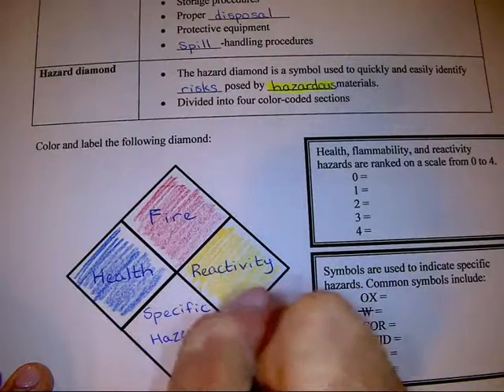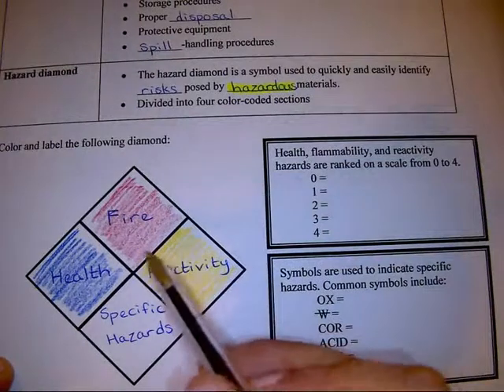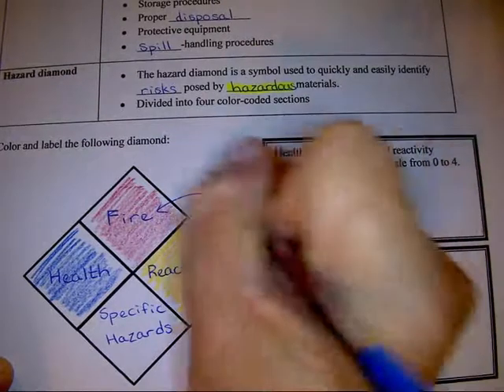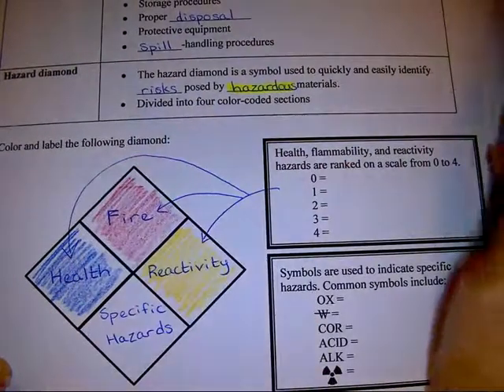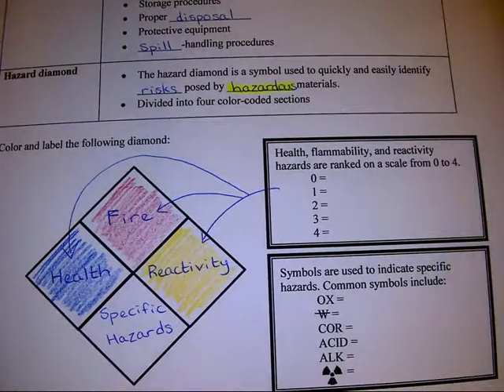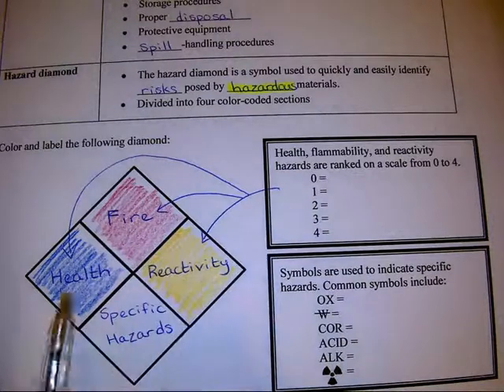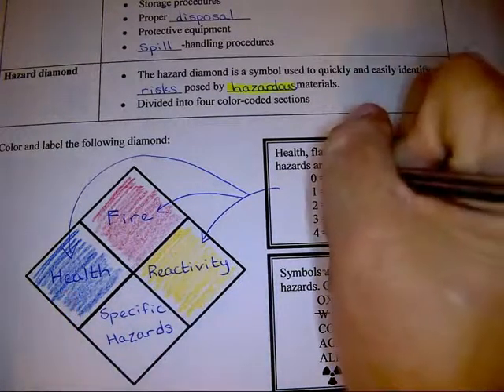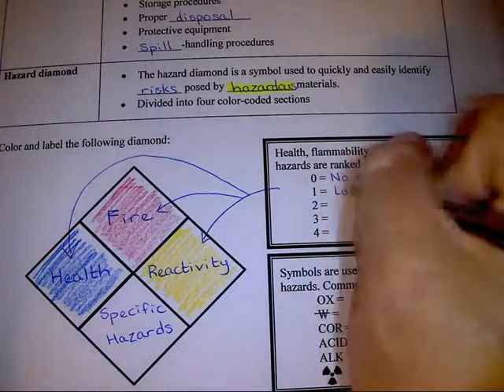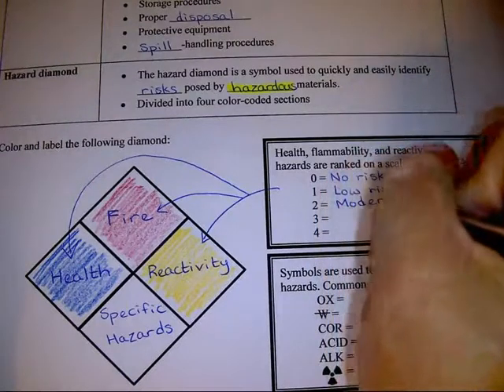Now in the red, the yellow, and the blue sections, we usually will have a number from 0 to 4. These numbers are basically telling us how hazardous, how dangerous this material is with regards to fire, with reactivity, and with health. 0 means that there's no risk at all. 1 means that there is a low risk. 2 means there's a moderate risk.